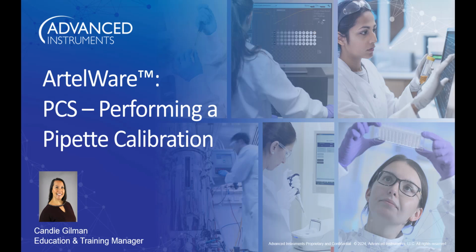Thank you for joining me for this brief video that walks through performing a pipette calibration using Artelware and the Artel PCS system. I've got some great information to show you, so let's go ahead and get started.